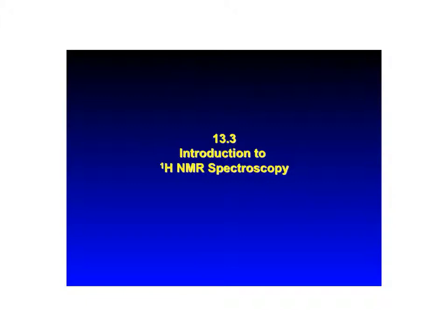Why do you suppose that proton NMR is so important? I mean, the rationale is actually very, very simple. Proton NMR is such a powerful tool because that's the most abundant thing that we have. Like 99% of all hydrogens are protons. So you've got lots of it around, so use it. A deuteron, which is H2, is silent. But tritium, which is H3, should be fine. However, it's in such a small amount that the likelihood of you having a tritium at every hydrogen location is going to be very, very slim. So it's the most prevalent form of hydrogen.